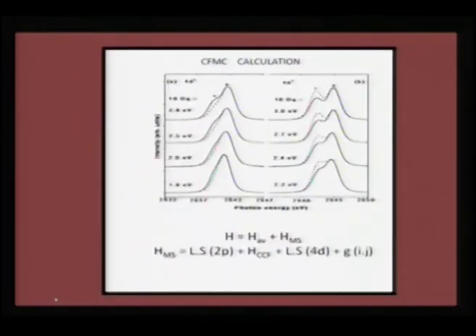Now to exclude the possibility of crystal field contributions other than those due to manganese doping, we can try to do a theoretical calculation also, where we map the L2 L3 of both 4d4 and 4d3 states.